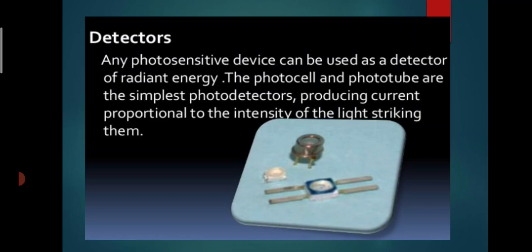Here we are using the detectors. It is generating the current, proportional to the light striking on them.